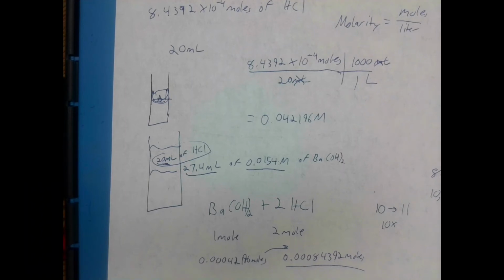Because it had the ever so slightly pink, or better yet, whenever you swirl it up, if you have it right at the perfect point, you can separate the acid and base slightly and get the top portion being slightly pink. Basically, you can swirl it up and cause it to change colors. If it's right at the equivalence point, whenever you shake it up, you might see it turn back pink temporarily. And whenever you set it back down, it'll settle out and no longer be pink. That tells you you're at the equivalence point.